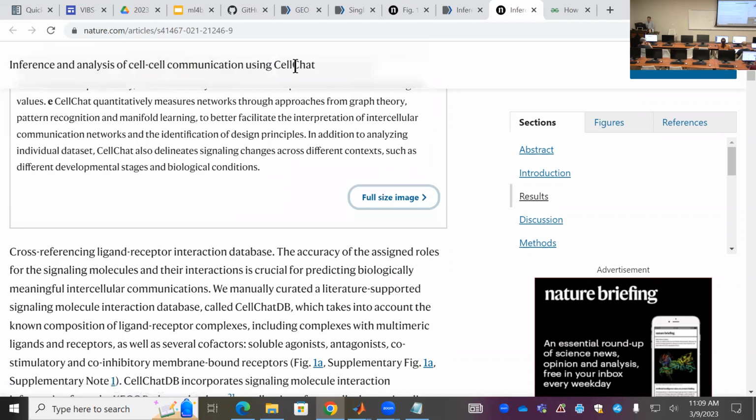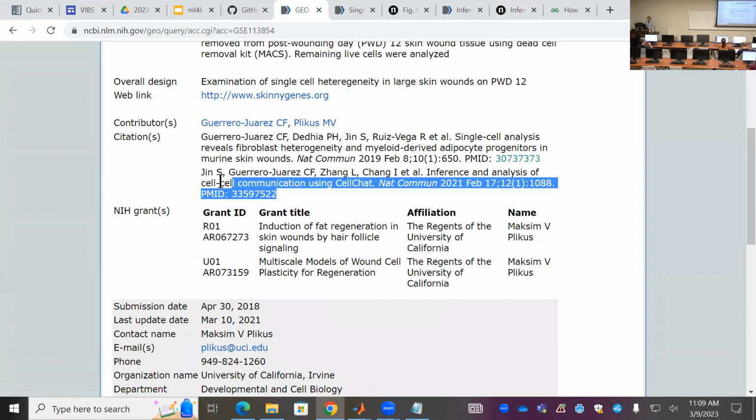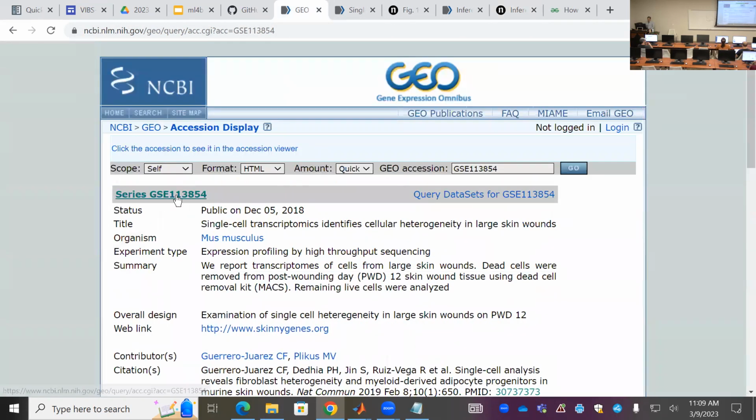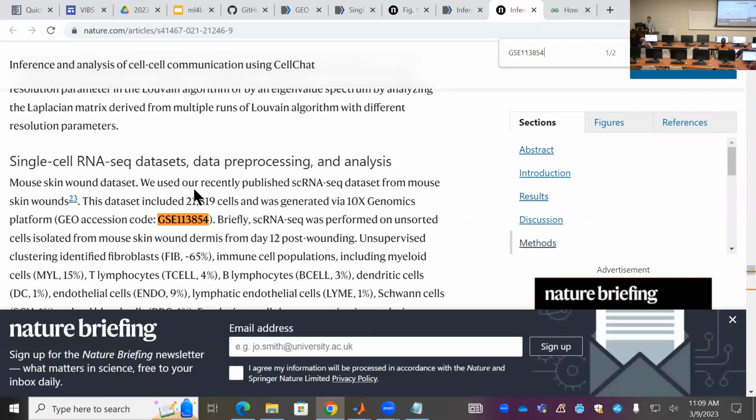The reason I look at this paper is because they mention in their record, which probably means this study used that data set. So we have to find it out. So I'm going to use this ID to see whether it has been mentioned in this development paper. Okay, single cell data, they use this test data.